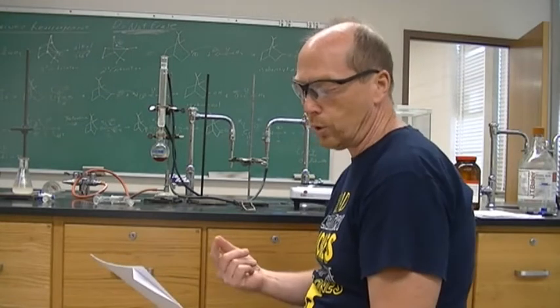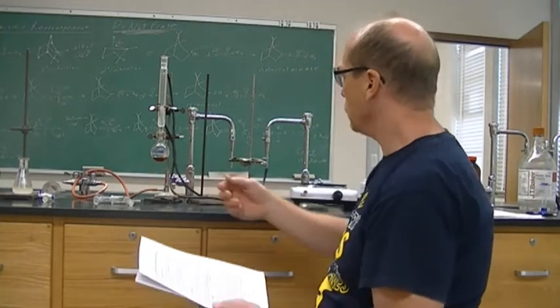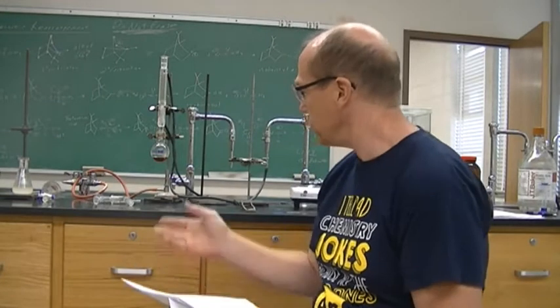And that solution was made by taking 1 gram of pure sodium or potassium hydroxide, 5 mils of 95% ethanol, and 1.6 mils of water. And now I am refluxing. It has been going a good 20 minutes, so soon it will be ready for the next step.